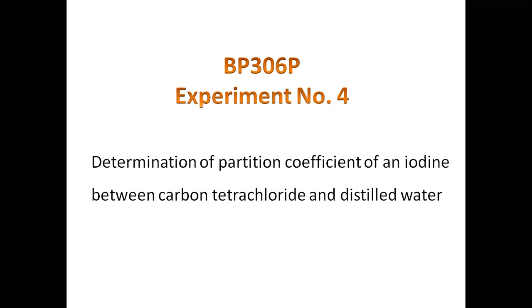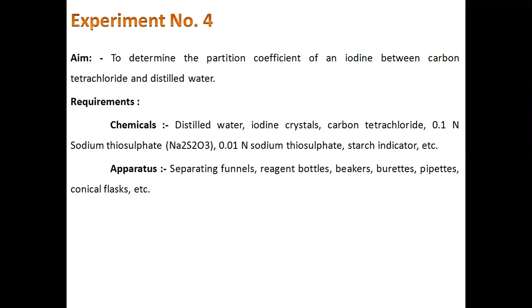Experiment number 4, determination of partition coefficient of iodine between carbon tetrachloride and distilled water. Aim of this experiment is to determine the partition coefficient of iodine between carbon tetrachloride and distilled water.